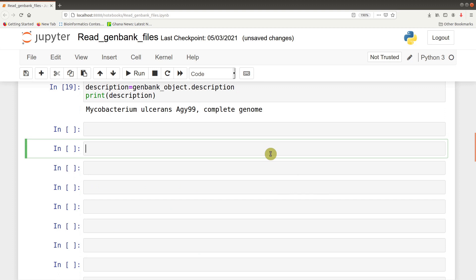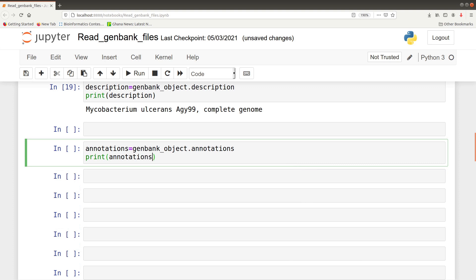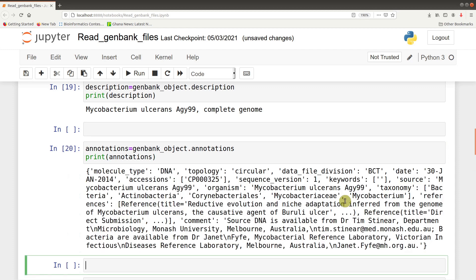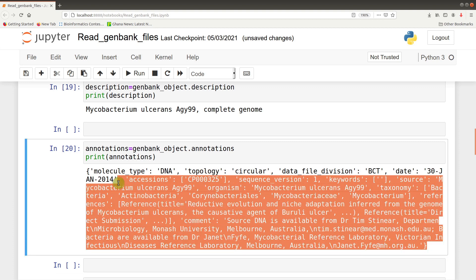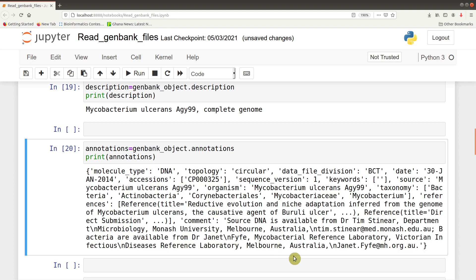We can also look at annotations: annotations = genbank_object.annotations, then print(annotations). Annotations tell you general information about the genome, including molecule type, topology, and other information. Note that this is a dictionary object, so if you want a more structured result from annotations, you need to write additional code — but that is beyond this tutorial.